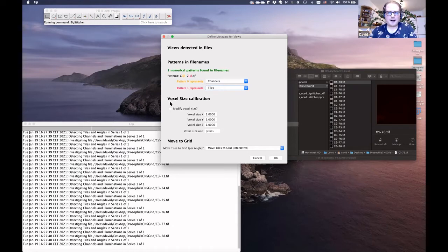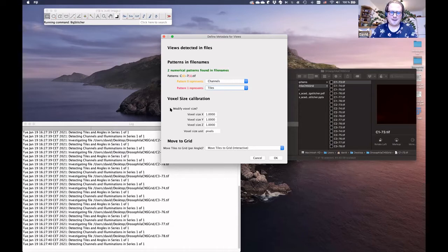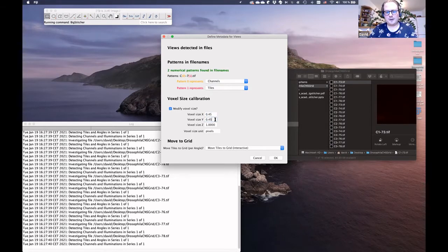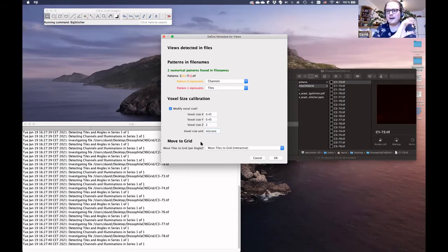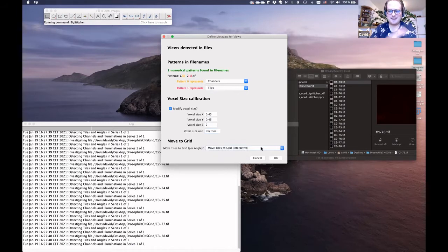BigStitcher also tries to parse the pixel size. In this dataset the pixel size is actually 0.45 by 0.45 by 2 microns, which you can manually set. Since we don't have metadata, we offer to move the images to a grid automatically and interactively — we'll see what that looks like in a moment.